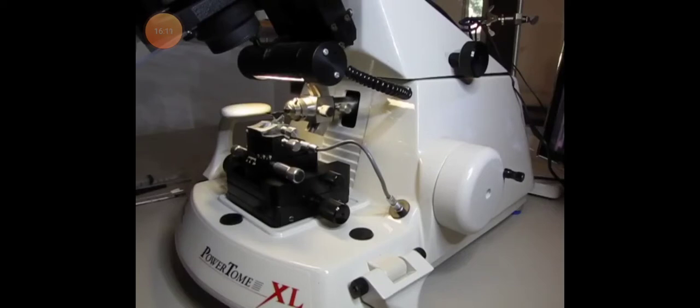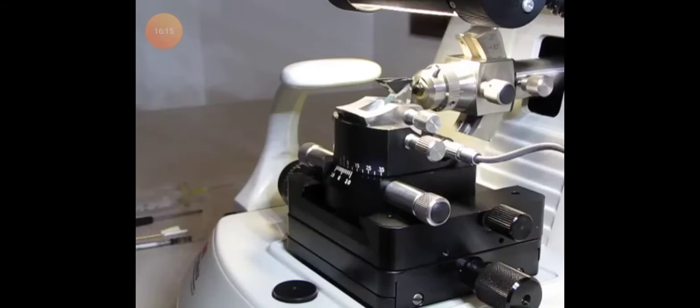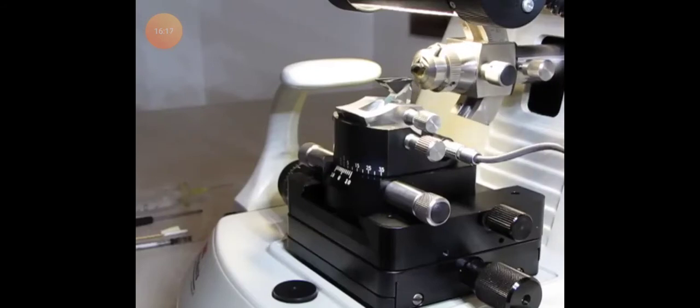No, you can see the machine is operated automatically, and we monitor the color of the sections as they come off. Usually it takes us one or two sections before the microtome equilibrates to temperature. We're getting a pale gold colored section to come off. I'm going to make it a little bit thinner. And now we're getting a very pale gold to light silver color.